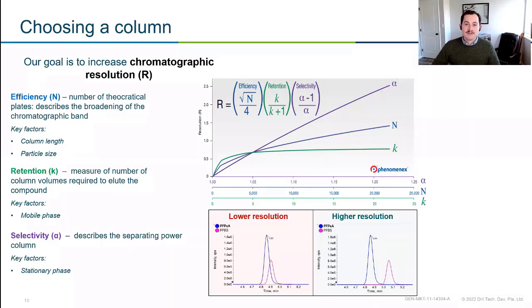Next would be retention. So retention is really controlled by your mobile phase. And that's just the amount of column volumes it's going to take for you to have your analyte of interest elute. So for LC-MS analysis and HPLC analysis, we really focus on sort of like 3 major solvents. Our aqueous, water, and methanol and acetonitrile are the next 2 common solvents that we use in terms of an organic. And they're going to affect when your compound elutes a little bit differently. So there's a little bit of wiggle room there in terms of what you choose as your mobile phase.